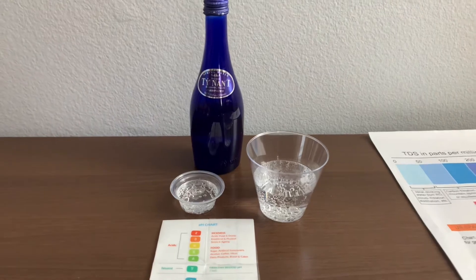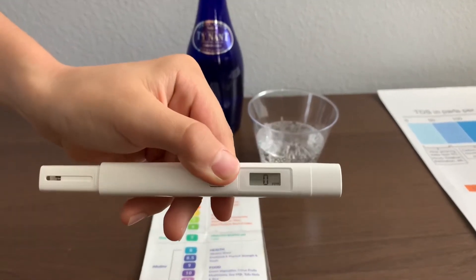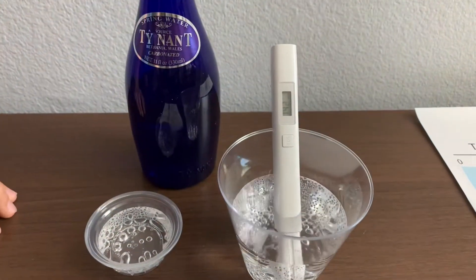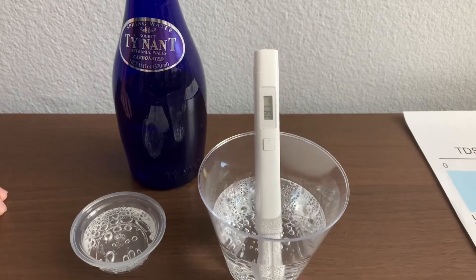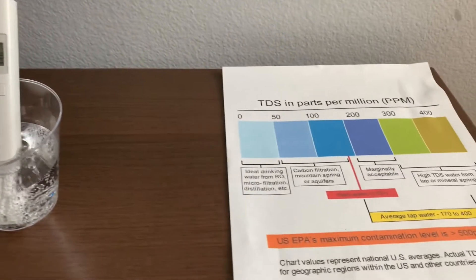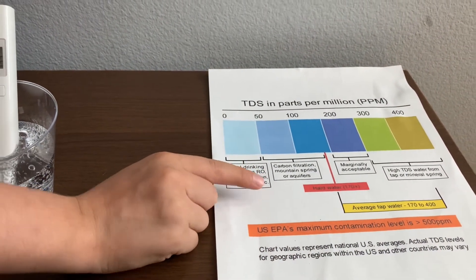First, let's test the TDS level. Turn on the TDS tester, make sure it says zero, and put it in. It's in the 100s — that is carbon-filtered mountain spring or aquifer water.